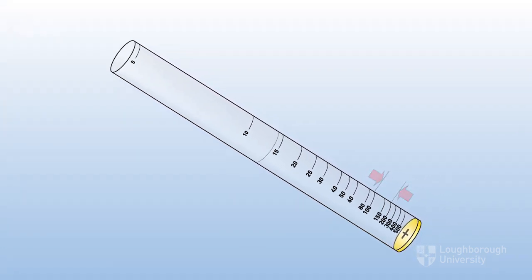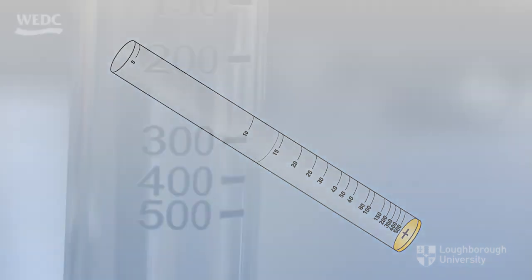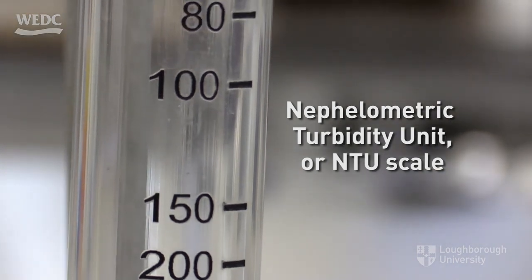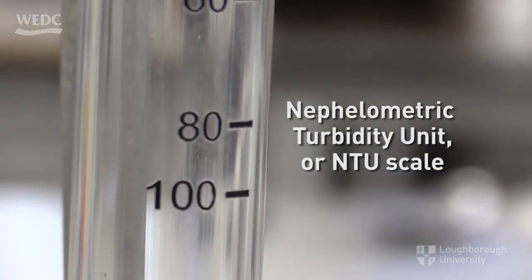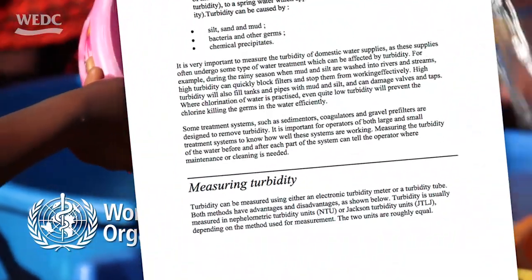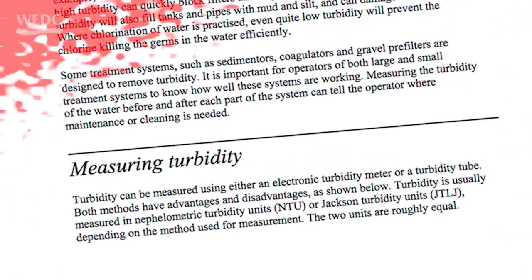This is a scale we use for taking a reading using the turbidity level. A typical unit of measurement is the nephelometric turbidity unit, or NTU. There are other units of measurement, but we use NTU here, as WHO make recommendations for drinking water quality based on the NTU scale.